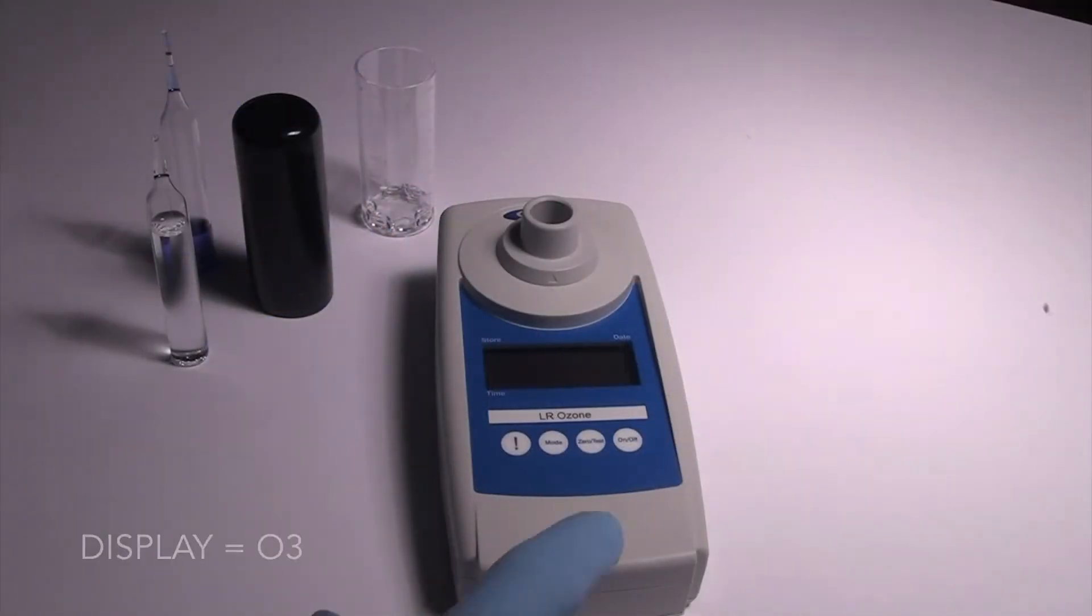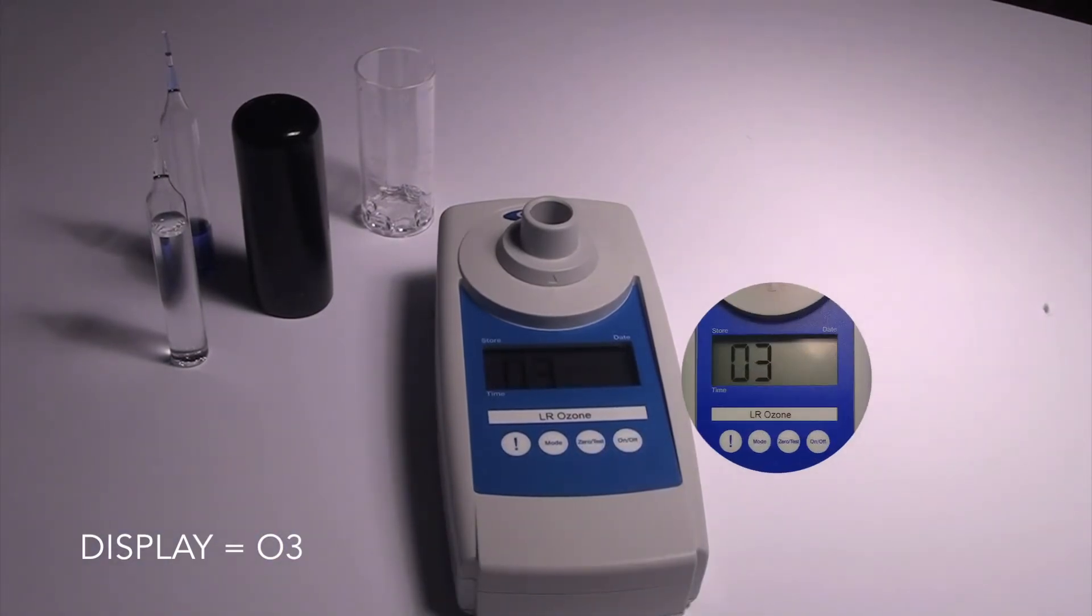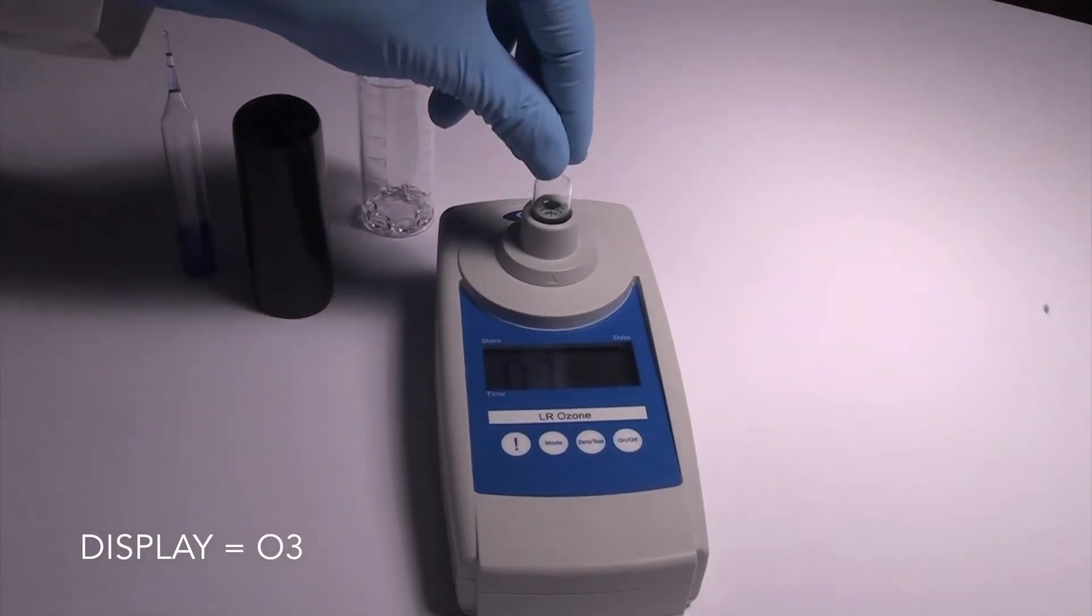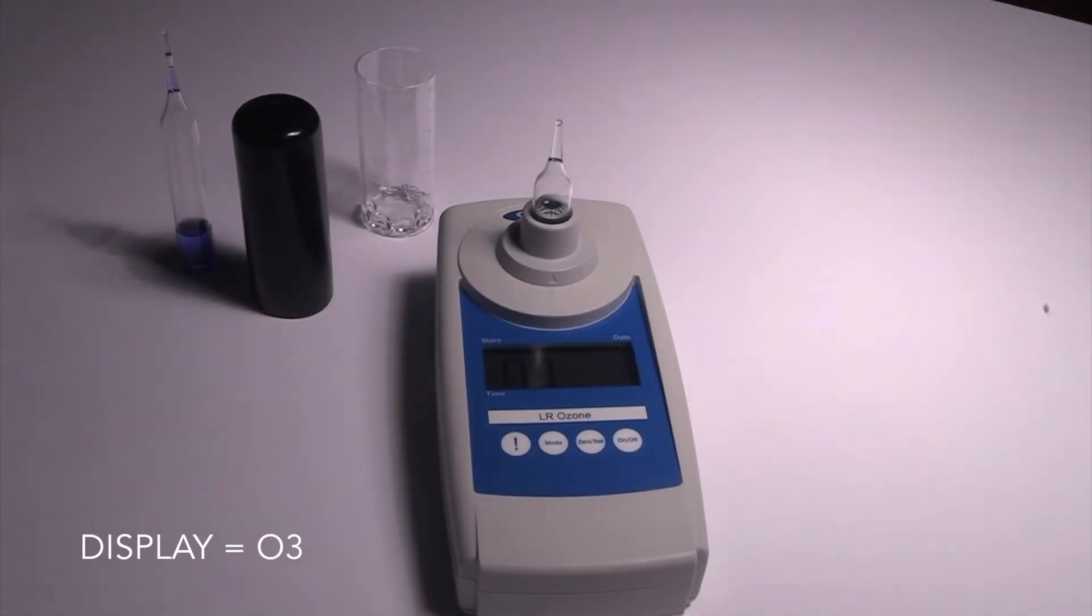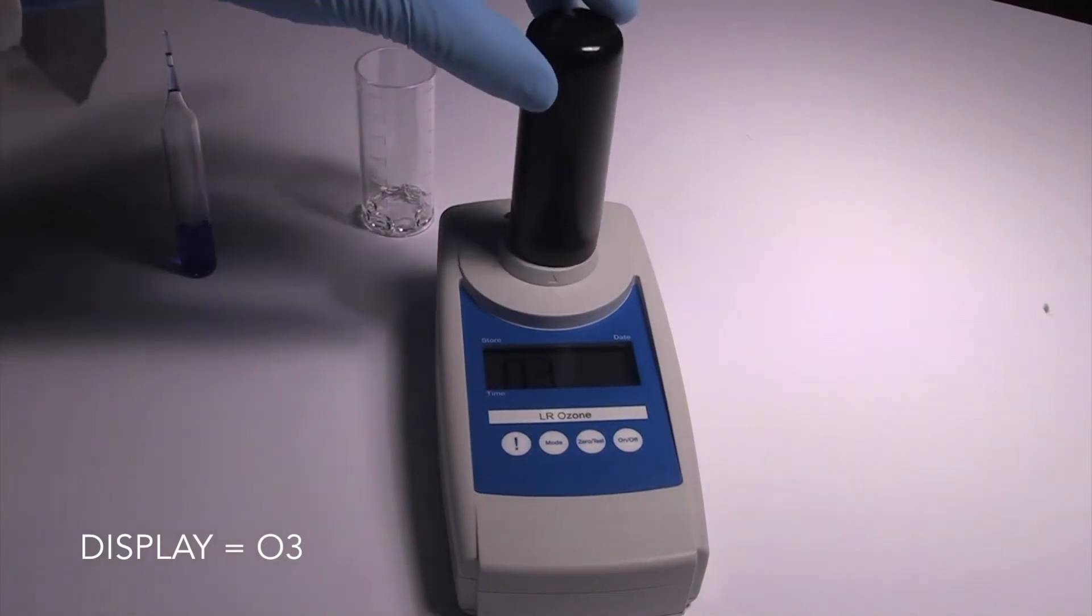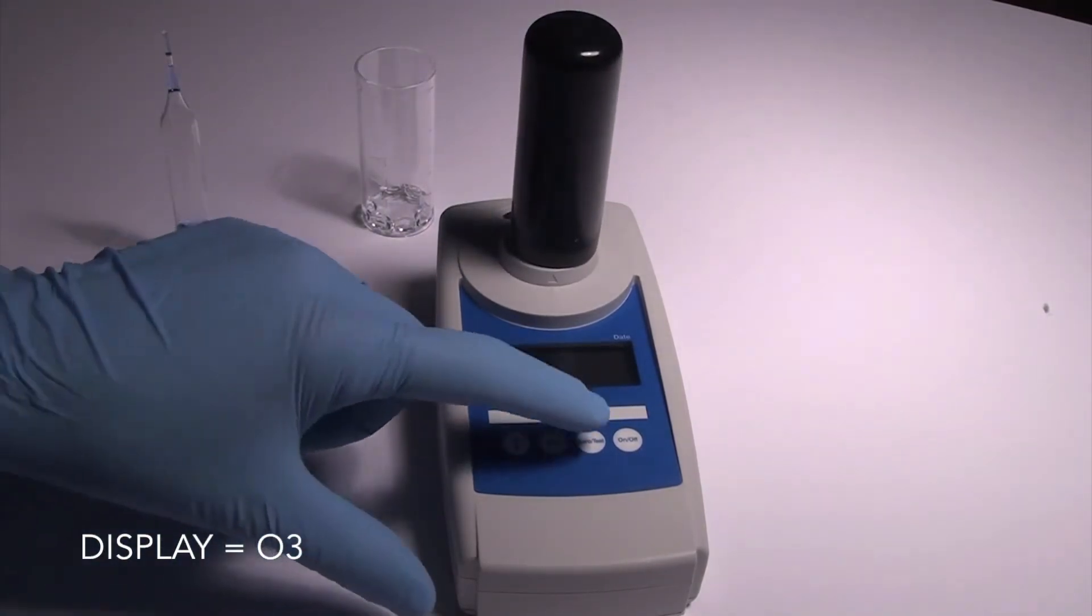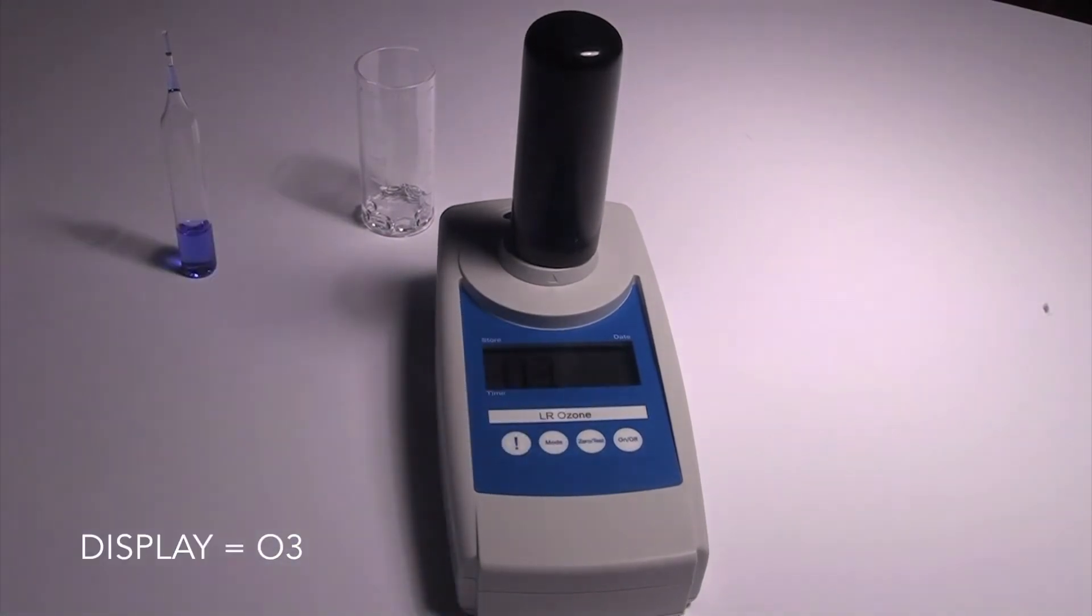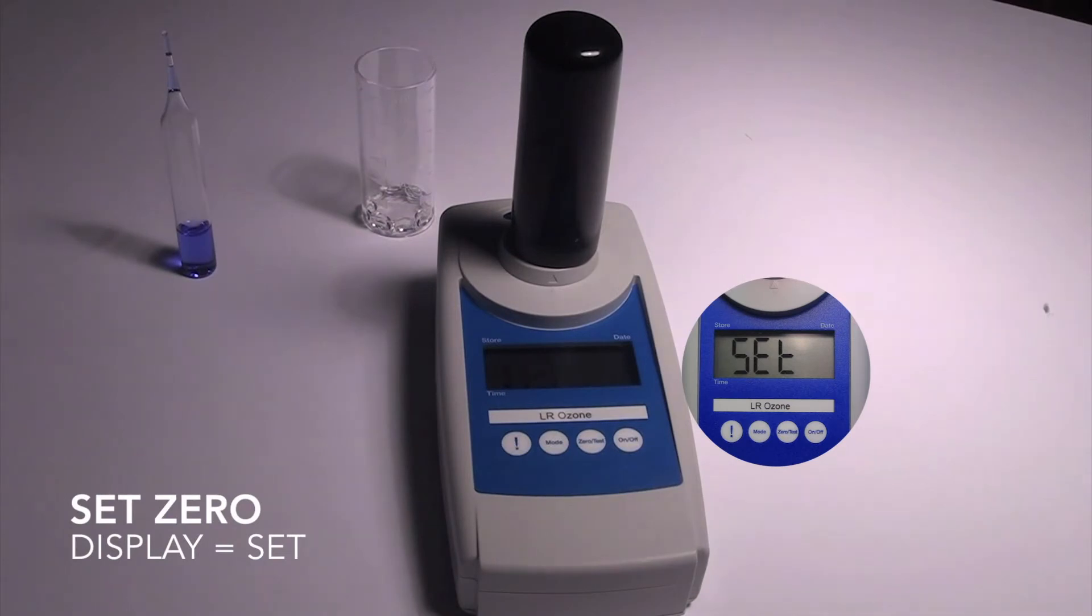To begin, zero the SAM. Press the ON-OFF key. The display will show O3 for ozone. Insert the zero ampoule, flat end first, into the sample cell compartment, making sure that it's fully seated. Place the light shield over the zero ampoule. Press the zero test key. The ozone symbol will flash for approximately 8 seconds, and then the display will show SET.